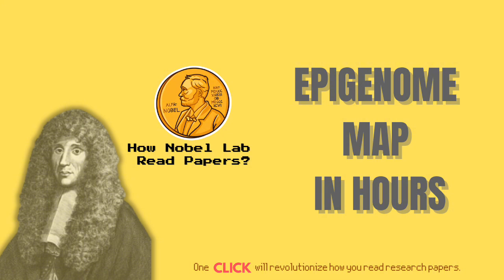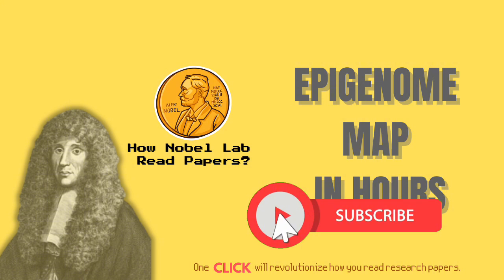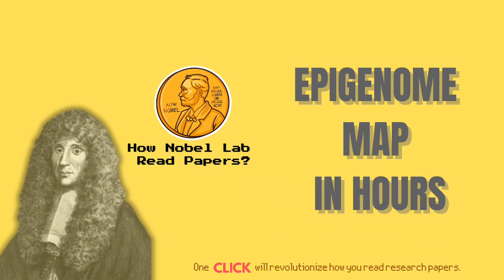That was the amazing part. The signal to noise was actually very similar, despite using 3 to 5 orders of magnitude fewer cells. Wow. So how's that possible? Just way more efficient. It's because the Tn5 is so specific for open chromatin, and the whole process is so streamlined, you avoid almost all those lossy cleanup steps from the older methods. It happens mostly in one tube. Okay, so that covers the accessibility mapping, the first piece of data, but you said 3 types.